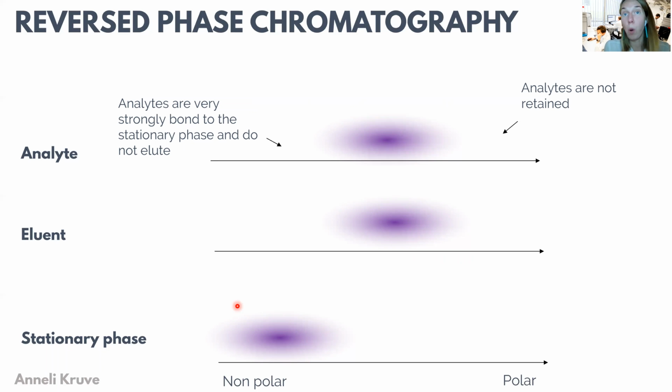Analytes which are very polar, for example, anions or cations, inorganic especially, are interacting with the mobile phase so strongly that they are not pushed to the stationary phase at all, and they aren't retained. So this means that they all come out from the column at the dead time together with the mobile phase front, and they would just not be separated therefore at all either.